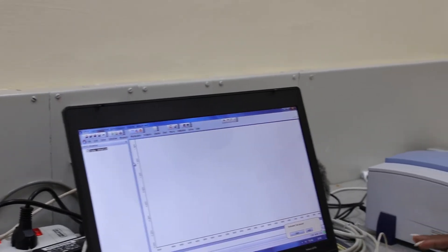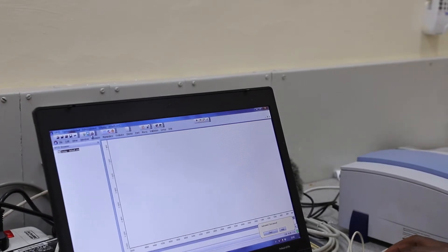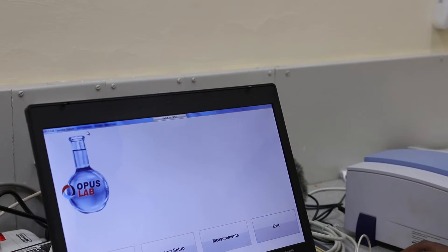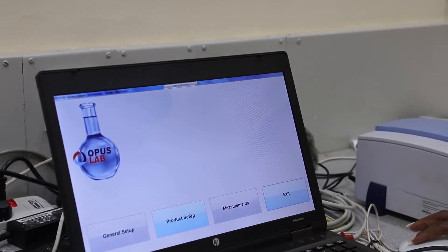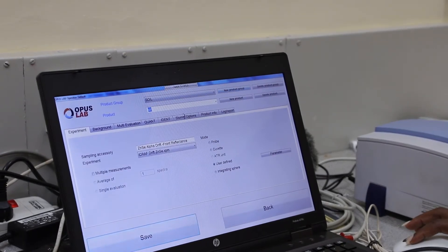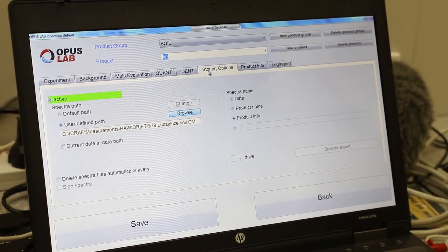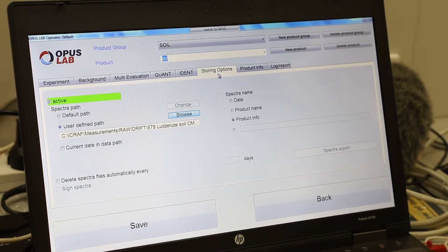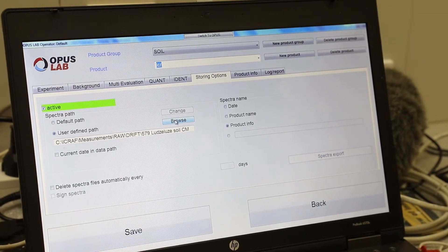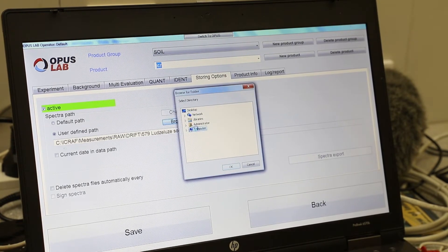After you have accepted the method, you go to the OPAS lab icon and double click on it. Then you go to the Product Setup and double click. You come to the Storing Option, where you must have already created a folder where you want your files to be stored. I am going to browse to find where I have saved my file.